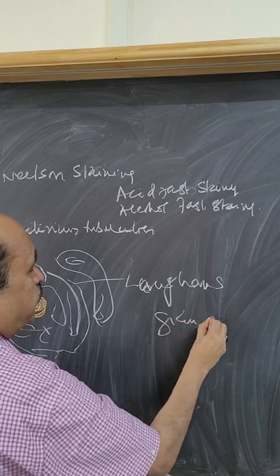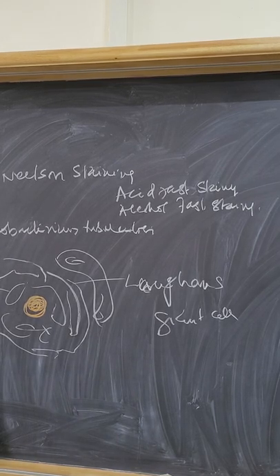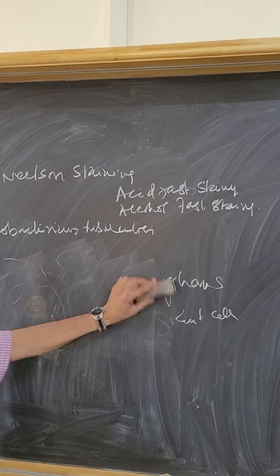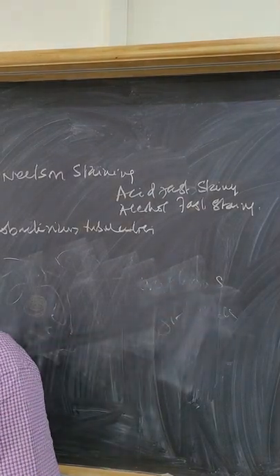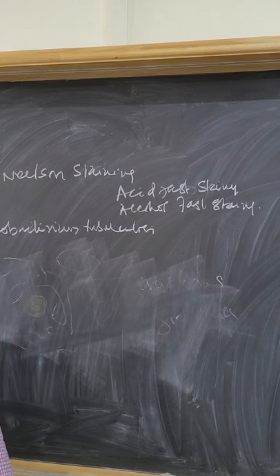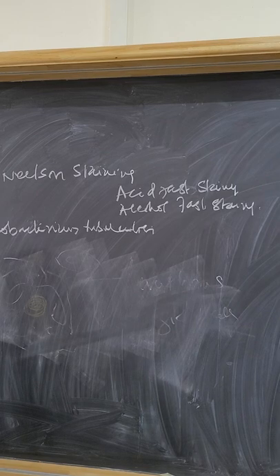Special giant cell called Langhans giant cell. So wherever you see a tubercle lesion, you can see a chronic granulomatous lesion called tubercle. Tubercle consists of a central area of caseation necrosis, surrounded by monocytes and macrophages. There is a special giant cell called Langhans giant cell.